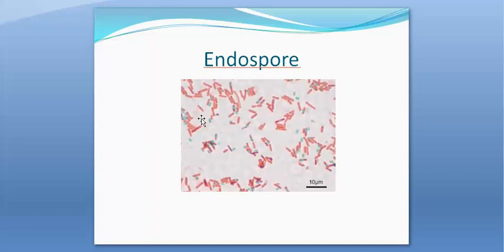Here is a slide showing the malachite green staining technique to identify spore-forming organisms with the green stain. The other organisms that are still mixed in here are in the vegetative state, bacteria that have not gone into an endospore forming situation.